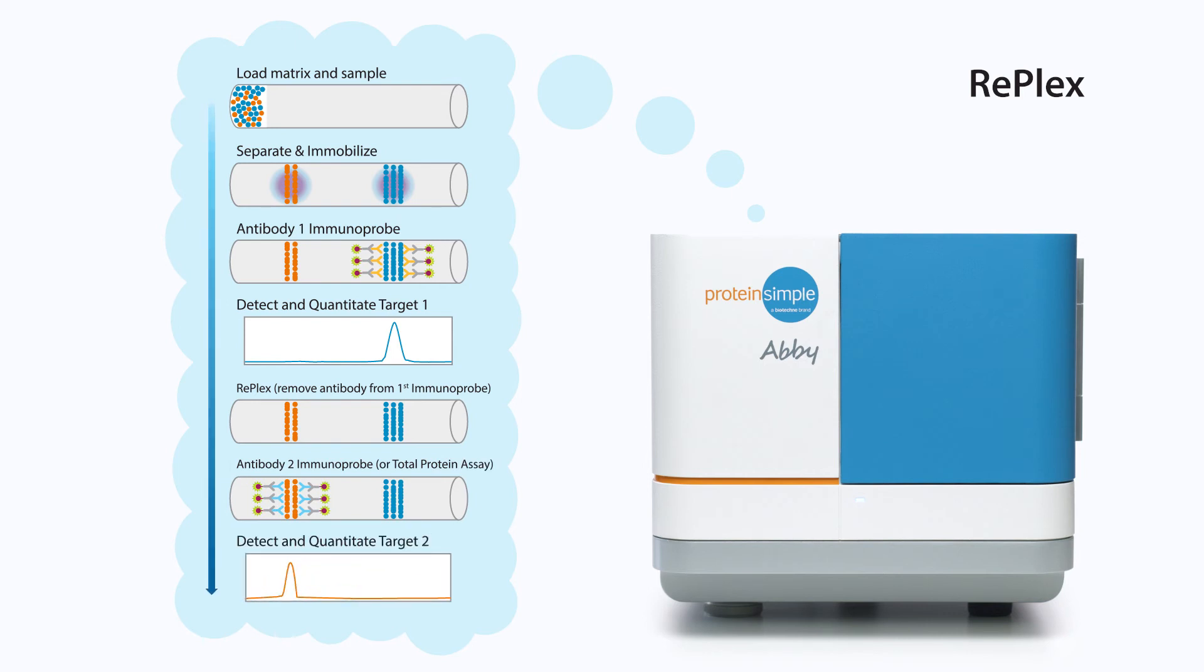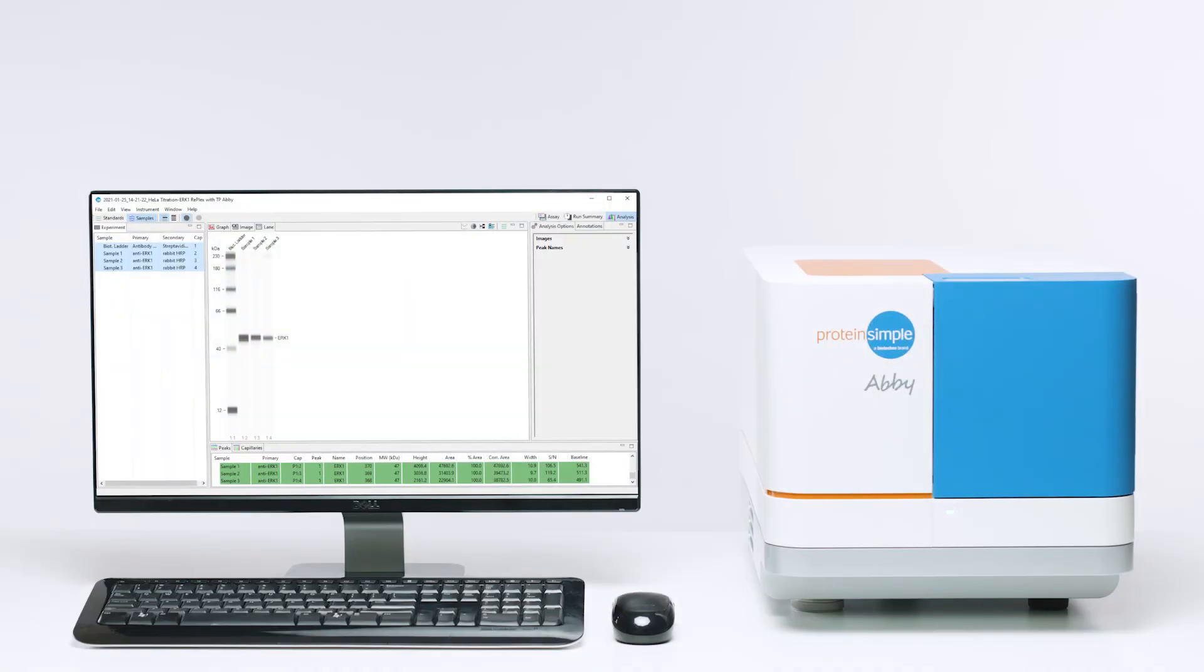To learn more about the RePlex assay, visit the RePlex product page on ProteinSimple.com. After your run, analysis is a breeze.